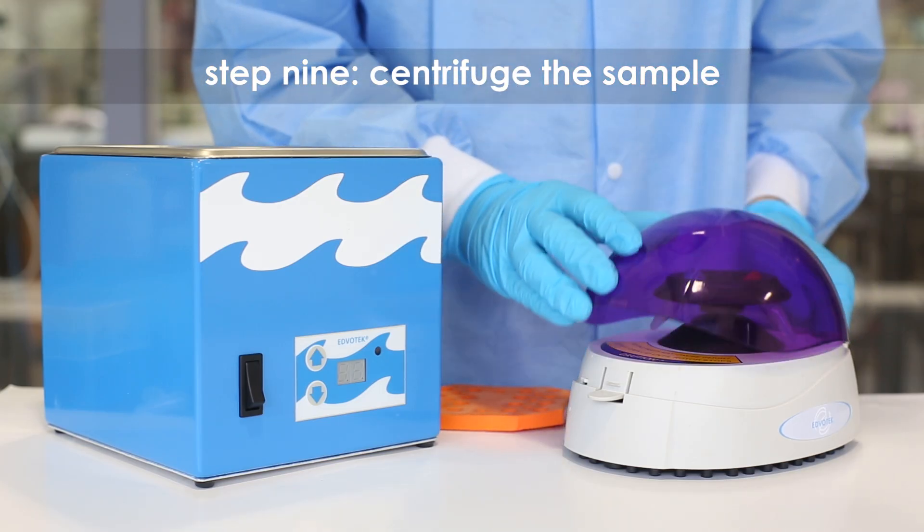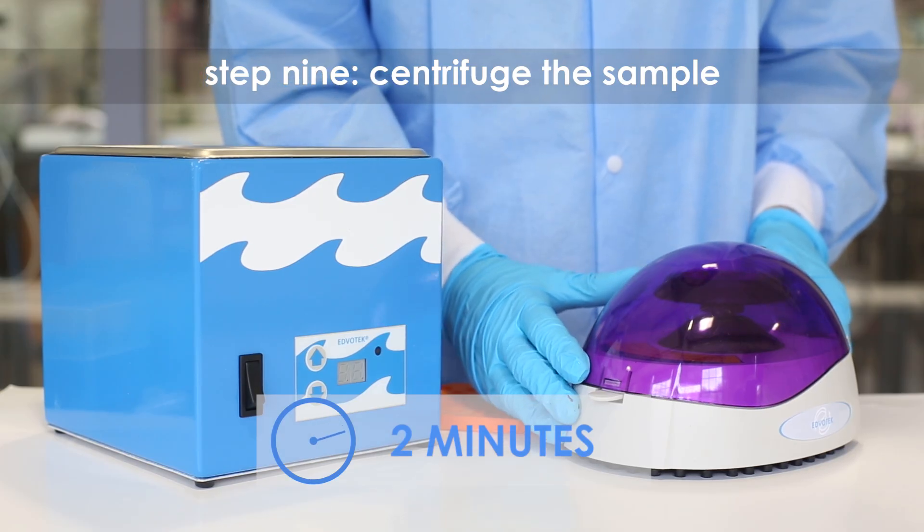Step 9: Centrifuge the cellular lysate for 2 minutes at low speed.